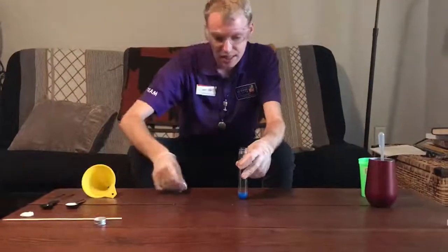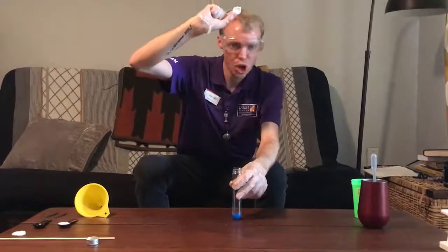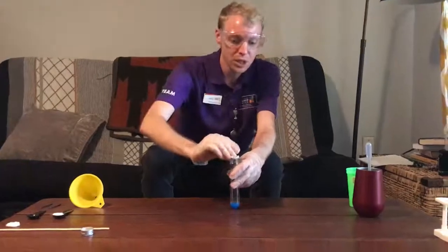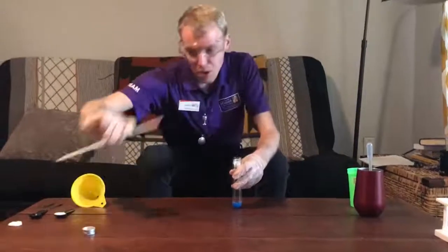And next, this is going to be just a round of cotton. So we're actually going to use this as a solid barrier. You're thinking cotton, that's interesting that we're calling it solid. Well, it is, because a solid holds its shape, but we're also using cotton because, as those of you following along probably guessed, it's going to absorb the water, and that's going to help us grow our crystals.